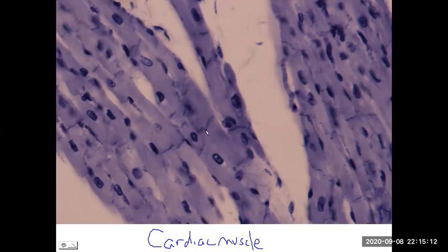Well, we can start with the terminology of an intercalated disc. You notice here, the very, very dark lines, intercalated discs. These are at the boundary, at the border of a cardiac muscle cell. So we could look around, and here would be a great example. From one intercalated disc to the next, that would be a good example of a cardiac muscle fiber. The striations, again, the alternating stripes, light and dark. Collectively, again, striations.